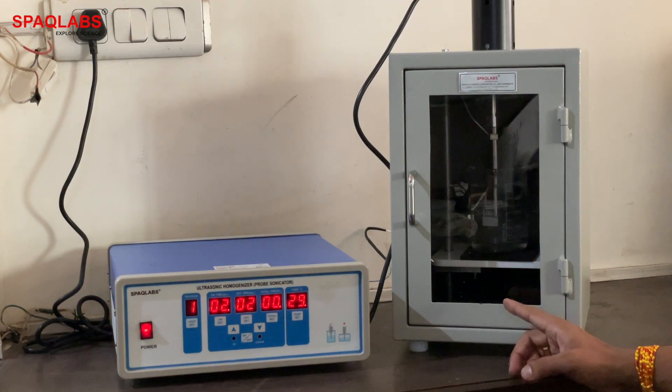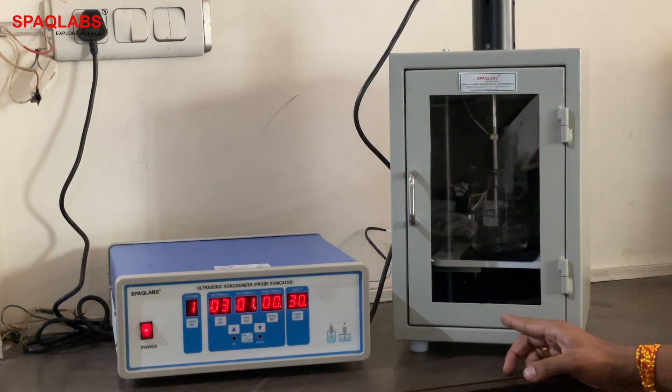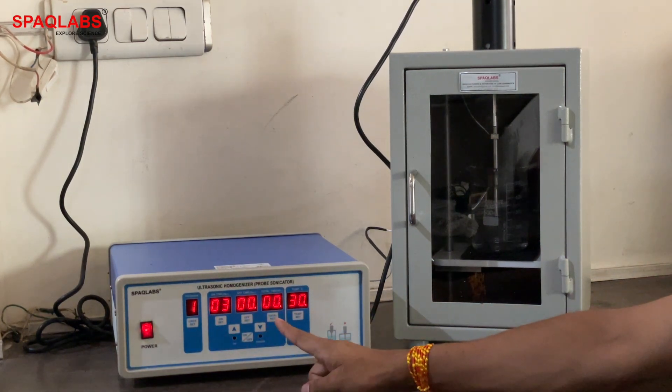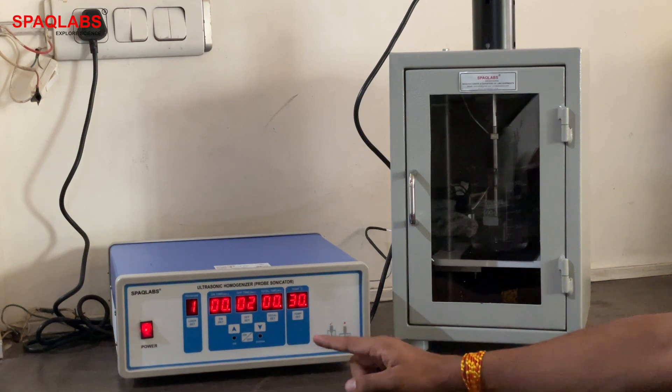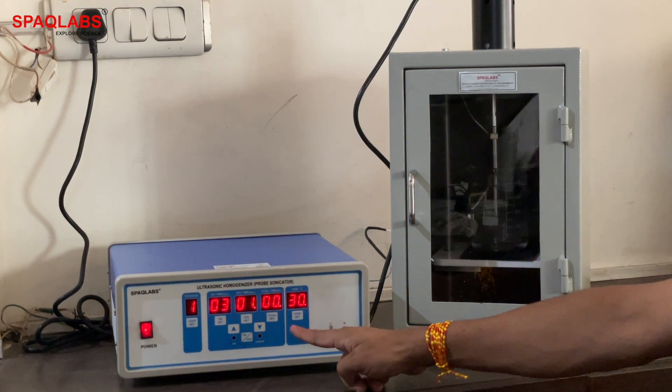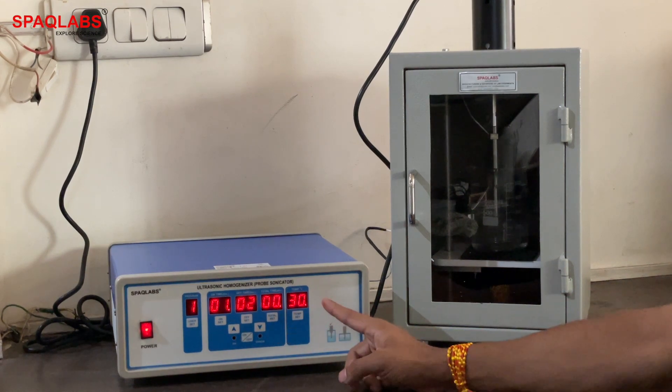The program is set to 3 seconds on, 2 seconds off, and the total time is 1 minute. After 1 minute it will switch off automatically. The current temperature of the water sample is also being monitored.